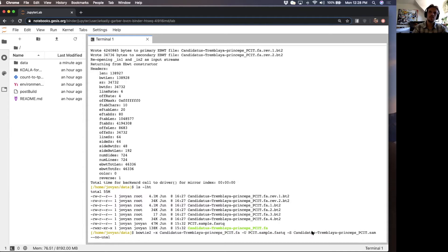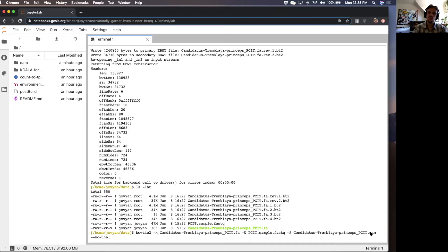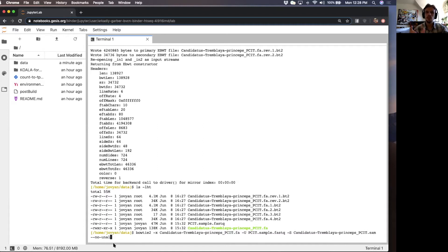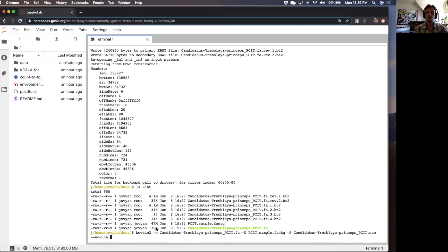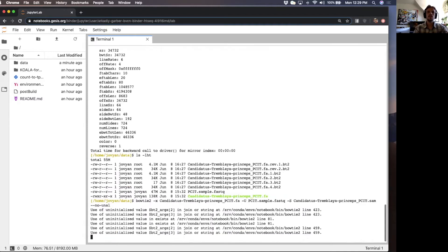If you have large data sets with a lot of reads and you want to minimize the amount of space that is used, these sequence alignment maps are huge files that take up a lot of storage. If you have a particularly small genome that you want to map reads to out of a larger data set, you can add this flag and the sequence alignment map is only going to include reads that map to this genome. It's not going to include the reads that don't map and that's going to significantly reduce the size of the sequence alignment map.